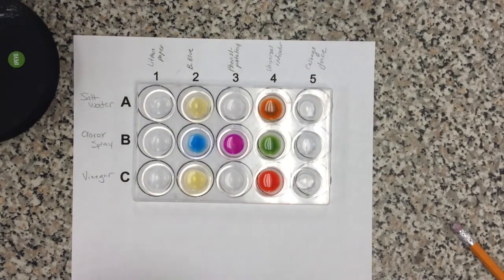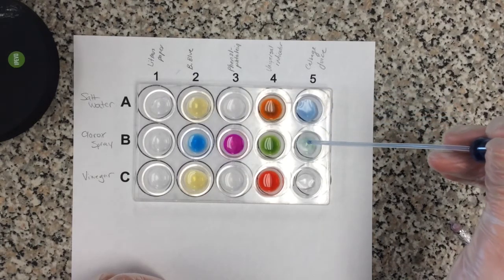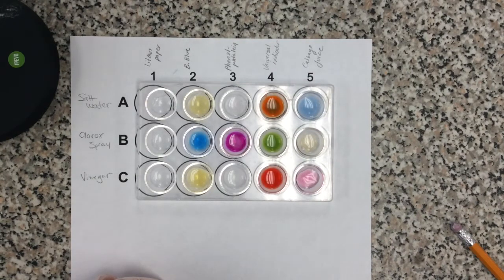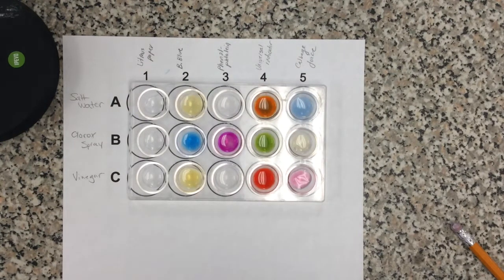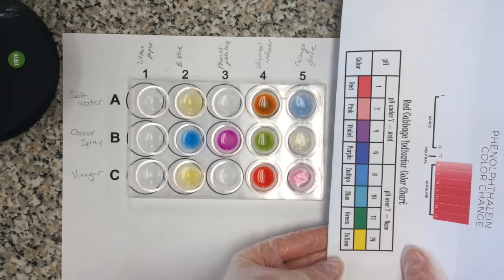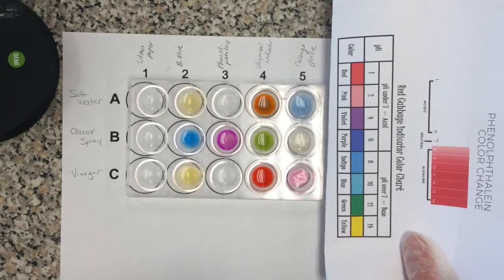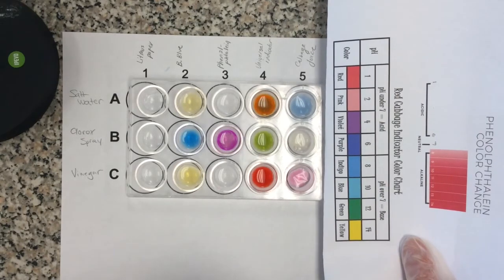All right. And our last one is cabbage juice. All right, so this is now where we are going to use this indicator sheet. Okay, so you'll know, right, if it's an acid, if it's a base, and you have an idea of how strong or how weak that acid or base is based on the color that it turns on this chart.